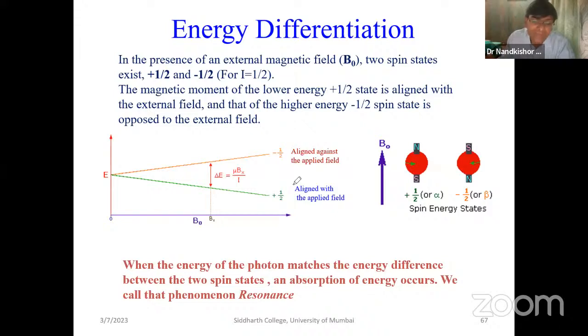And when we apply a radio frequency source as energy to do the flipping, that is what we call the transitions. That radio frequency energy matches this energy gap, and there is a flipping of the plus half into the minus half.